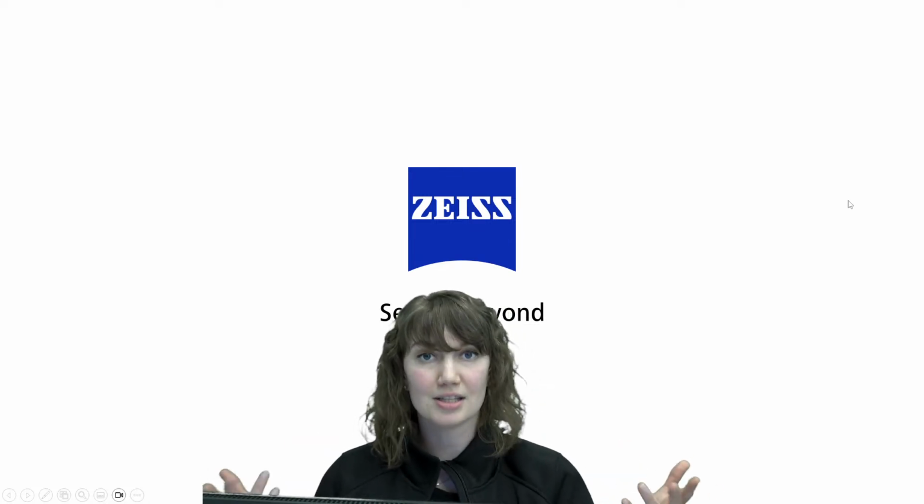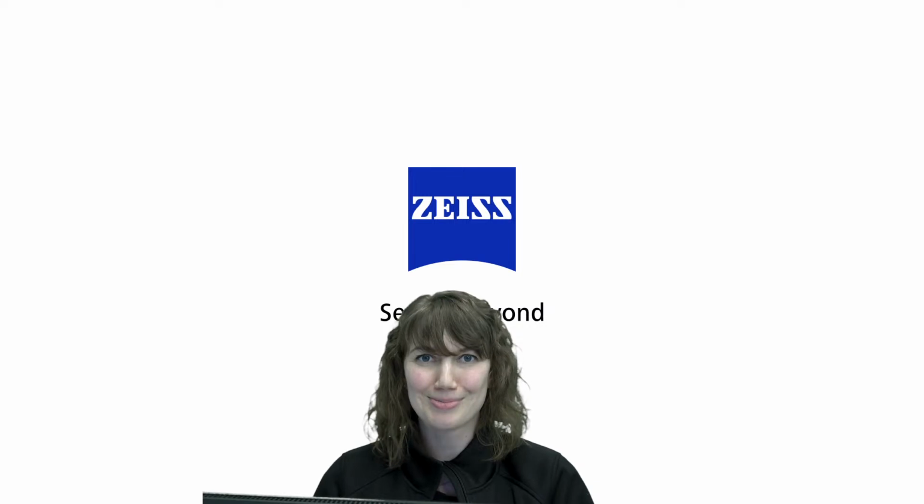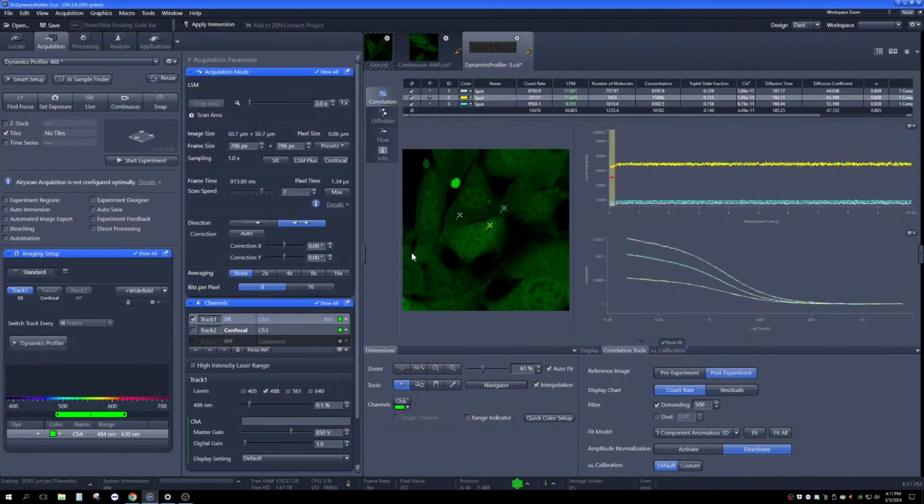So with that, I'm actually going to go ahead and we're going to hop over to the LSM900 that has the Airyscan detector and Dynamics Profiler on it. And I'm going to show you how easy it is to walk through that wizard. You don't have to be scared of all the math that's typically involved in FCS. We've made it really easy to do all of that. I'm going to show you a real-life example on our LSM900.